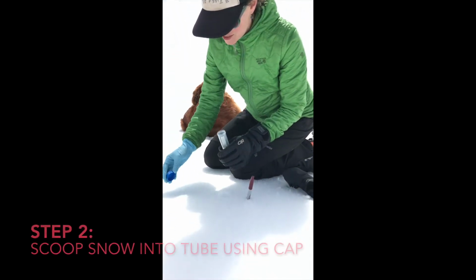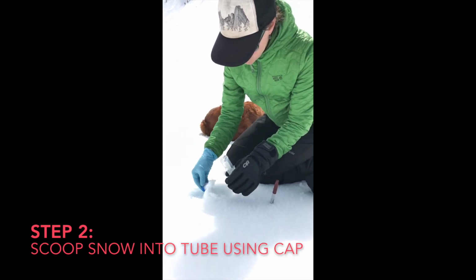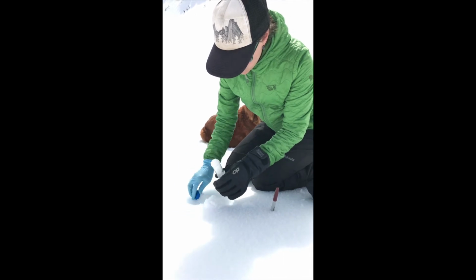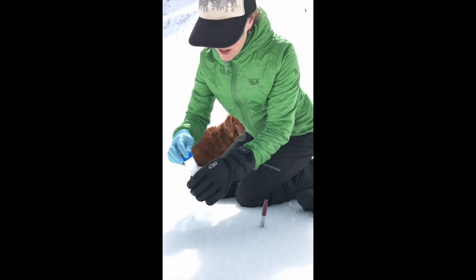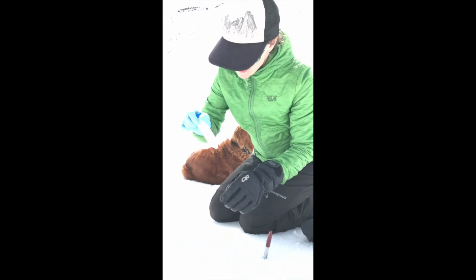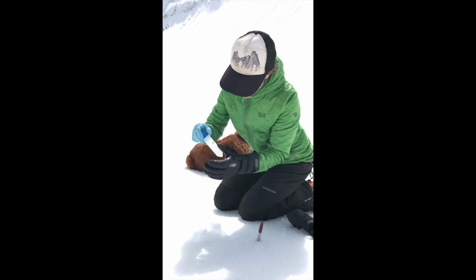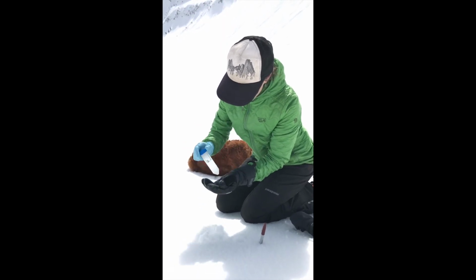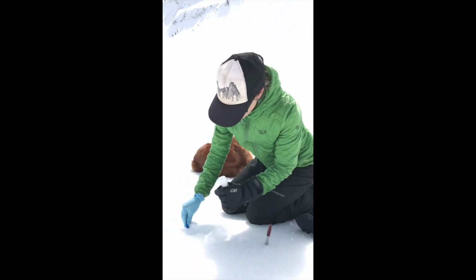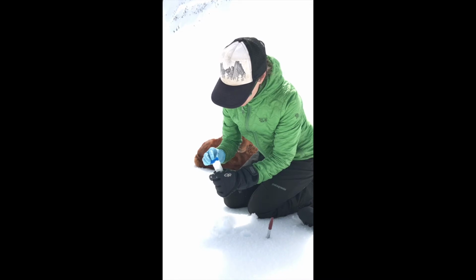The easiest thing to do is to scoop the surface of the snow into the tube, like that. I sort of get as much in as I can. Close the tube, shake it, because that'll get things to melt and move down so that you can get more snow in there. So I do that a few times.